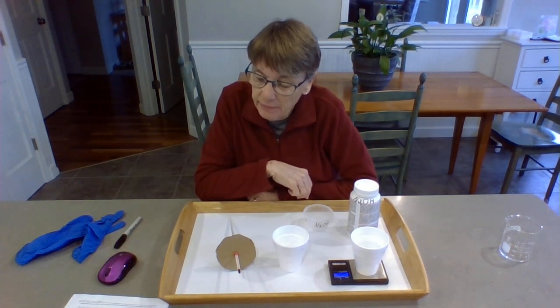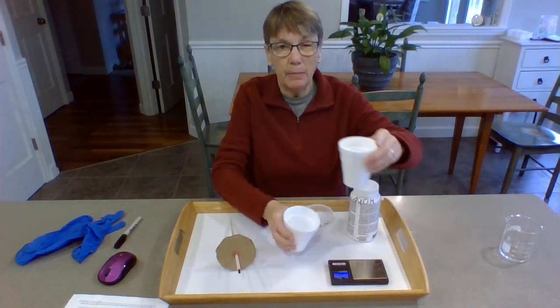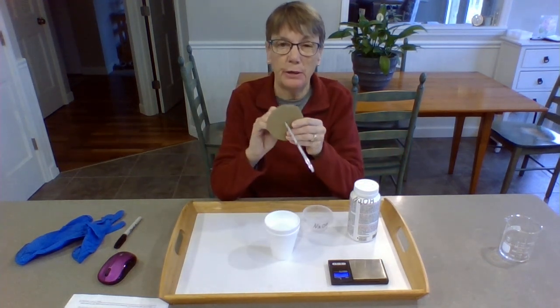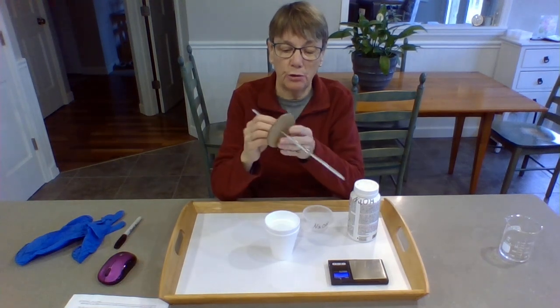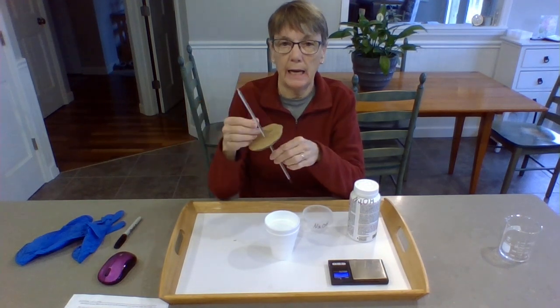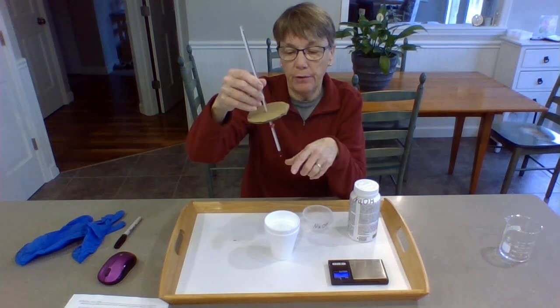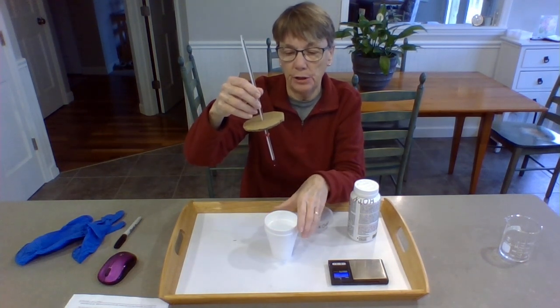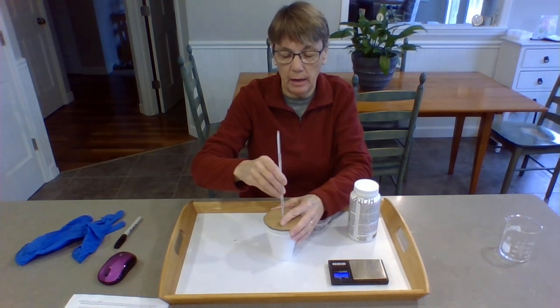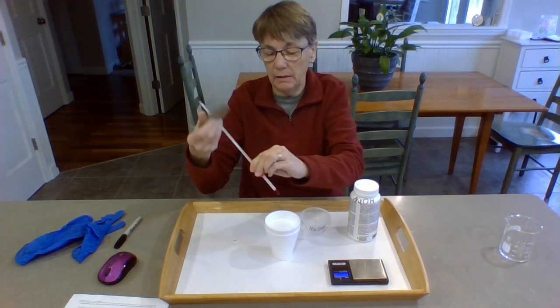All right, step 5. Put the lid and thermometer on the calorimeter. So I'm going to put this top cup into my bottom cup. This is my calorimeter. I just have the thermometer with the cardboard cutout circle here, and that's going to keep the heat in, so my measurements will be more exact. I'm going to put that in my calorimeter. Now you want to be careful that the bottom of the thermometer is not touching the bottom of the cup. So it needs to be suspended in the liquid, but not touching the bottom of the cup. So I'm just going to adjust that.